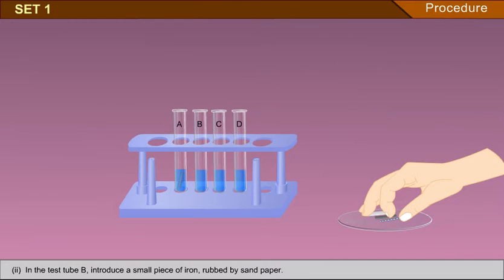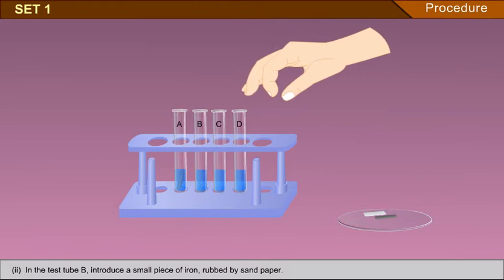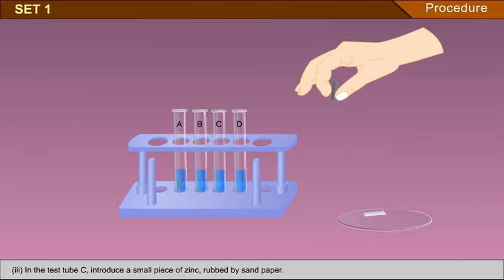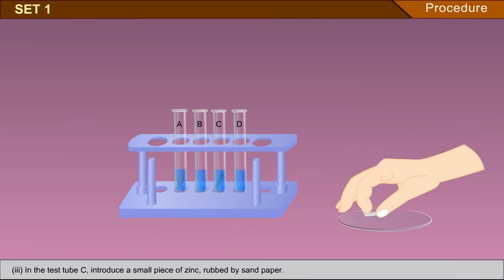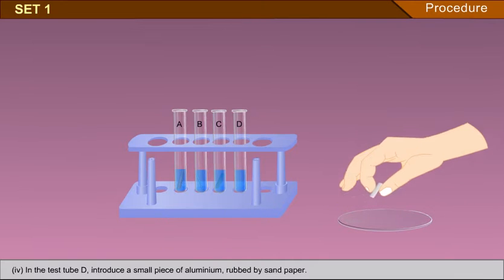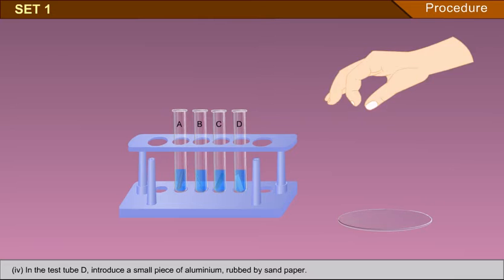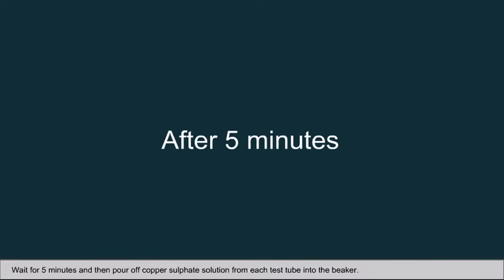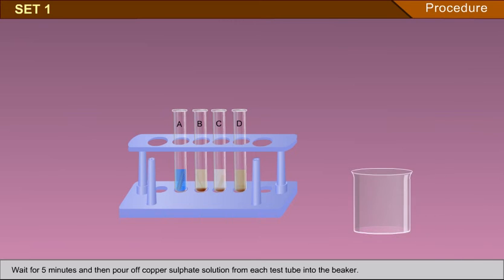In test tube B, introduce a small piece of iron rubbed by sandpaper. In test tube C, introduce a small piece of zinc rubbed by sandpaper. In test tube D, introduce a small piece of aluminium rubbed by sandpaper. Wait for 5 minutes and then pour off copper sulphate solution from each test tube into the beaker.